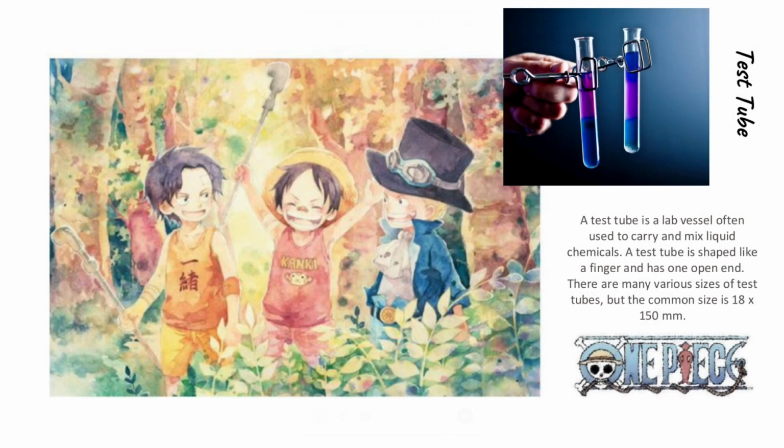A test tube. A test tube is a lab vessel often used to carry and mix liquid chemicals. A test tube is shaped like a finger and has one open end. There are many various sizes of test tube, but the common size is 18 by 150 mm.